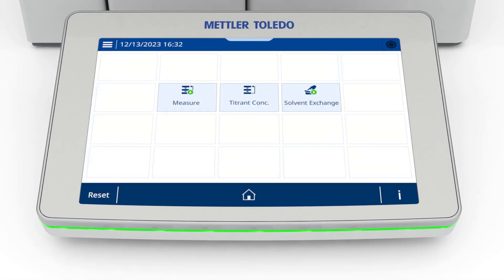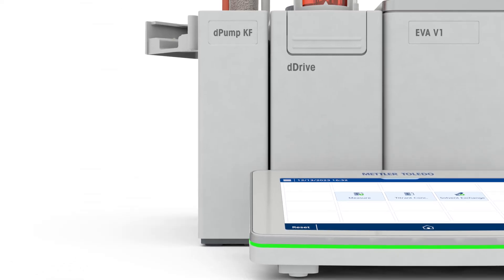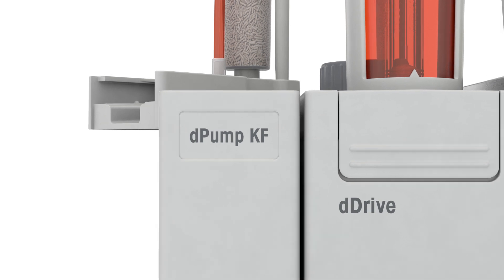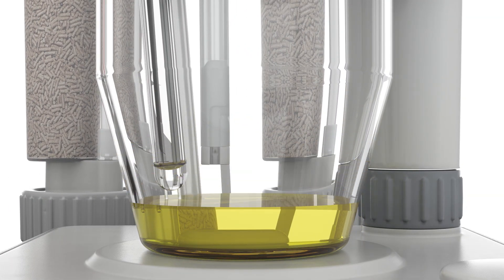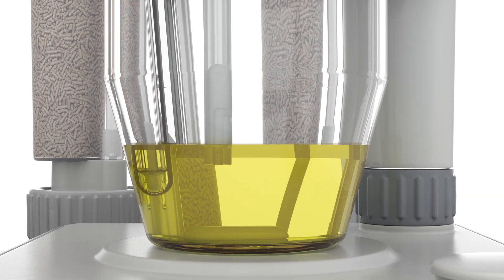Significantly speed up your daily tasks with the simplicity of one-click technology. To avoid exposure to harmful reagent, the D-Pump KF facilitates filling, purging, and exchanging of the reagents automatically.